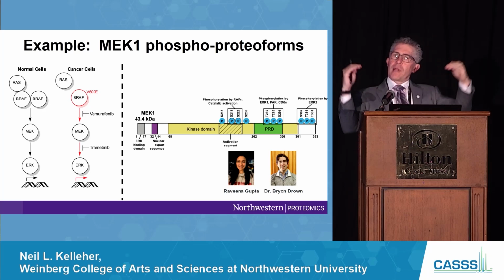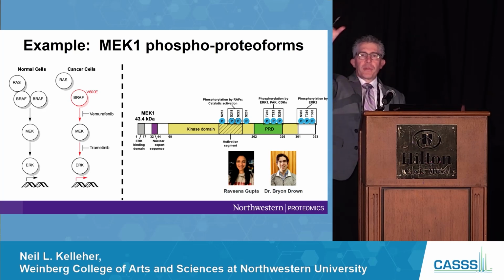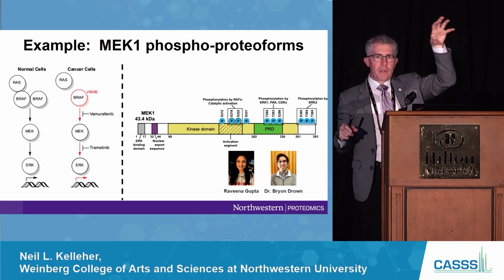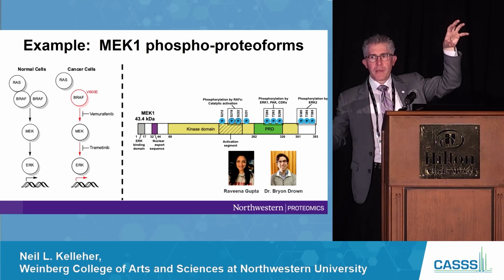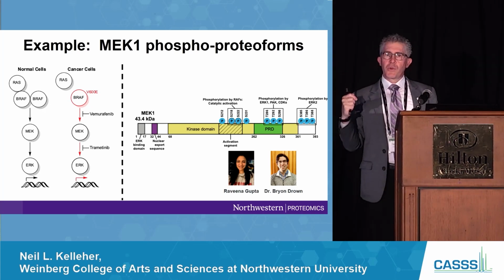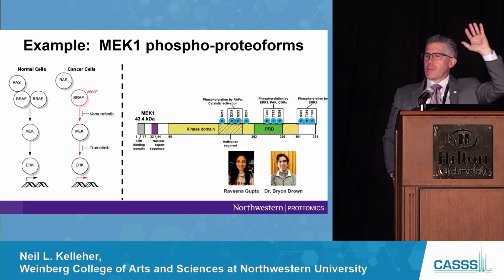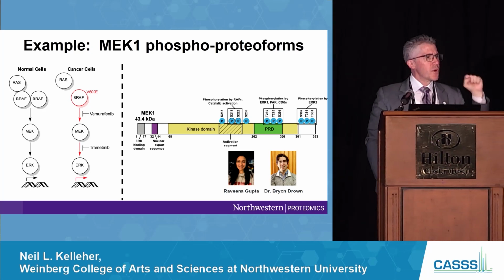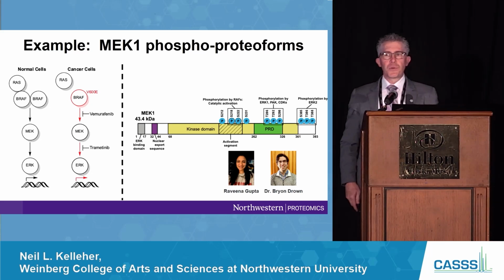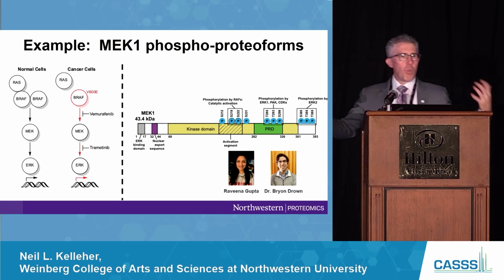But right in that last point, I want to step back and say that belief that you can get orthogonal, and I'm arguing better information by top-down versus all the peptide madness that you would experience trying to localize those 9 phosphos, find out which ones are the functional ones, which ones are the high stoichiometry ones. This is the balance, but people think, oh, top-down's too hard. The tools aren't there, right? And that, 10 years ago, was true. Every year that goes by, that's getting less true. So it may start to tip your balance in your own organizations about who to hire, what platforms to invest in.